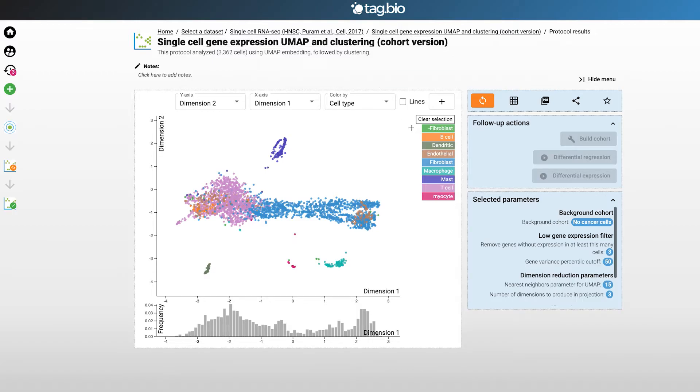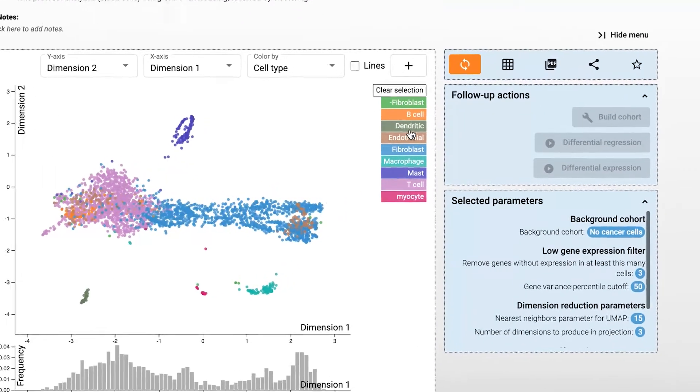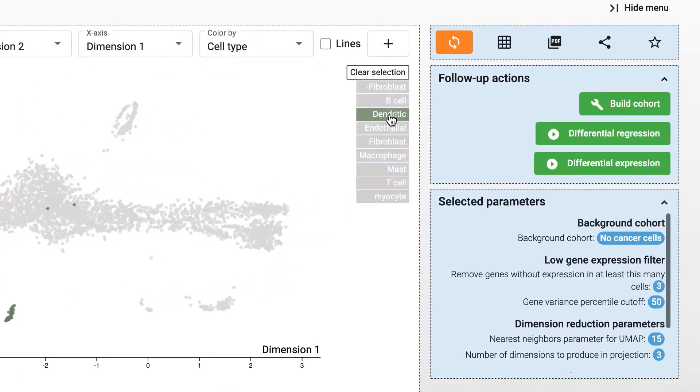What else can you do here? Well, you can run a differential regression. This will allow you to look at what genes are differentially expressed, either up or down, in your selected cells. Let's try selecting the dendritic cells and click on the differential regression button.